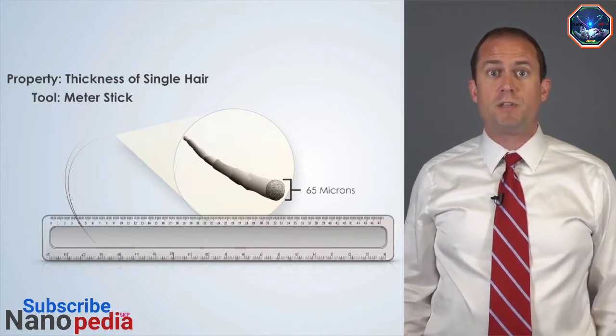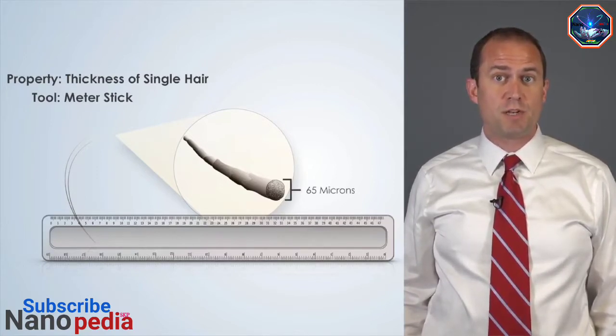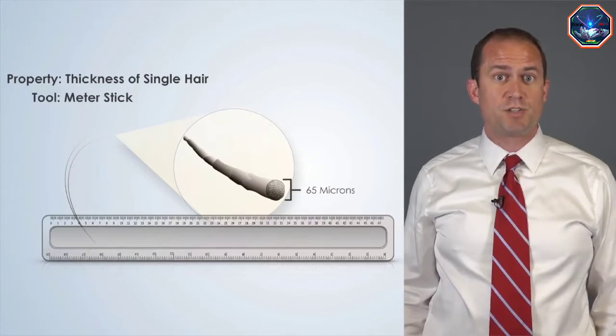The subdivisions only go down to millimeters, about 10 times the thickness of your hair. One million nanometers are in a single millimeter, or the smallest subdivision on our ruler. This is the scale we are measuring at with nanomeasurement tools. Visualizing and characterizing a specimen at the nanoscale presents significant challenges and requires highly specialized tools and equipment and highly knowledgeable operators to use them.